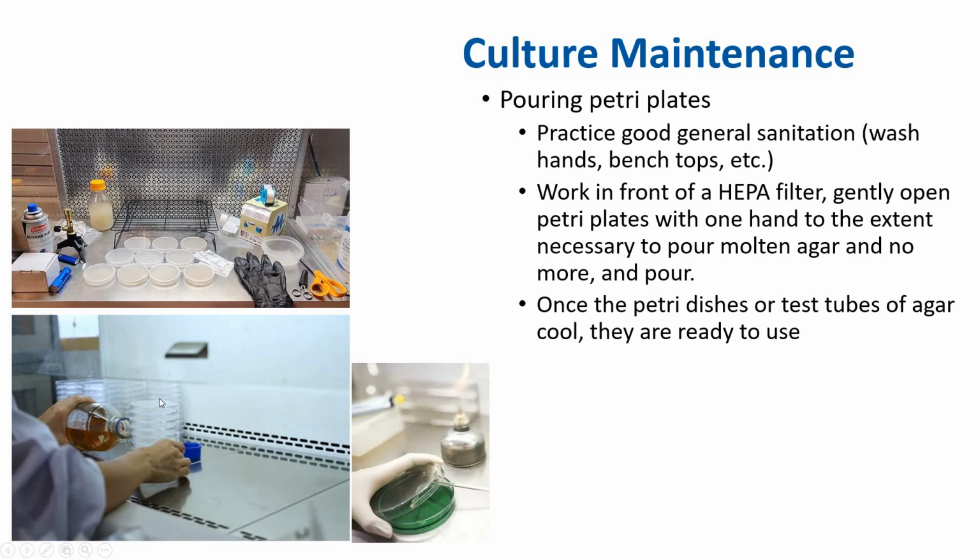The sterile air is blowing, and you want to be pouring the sterile petri plate right around the middle right here. You want to lift up the plate just slightly so you can pour the media in. You don't want to just leave the lid open, right? Because spores can fly in.